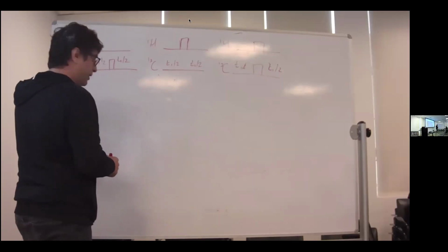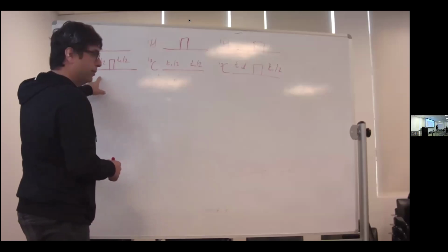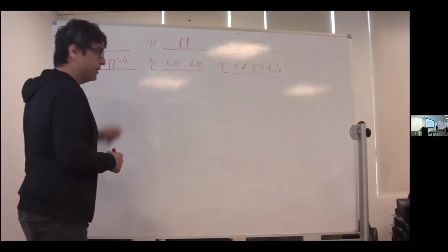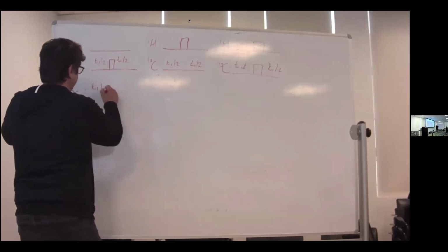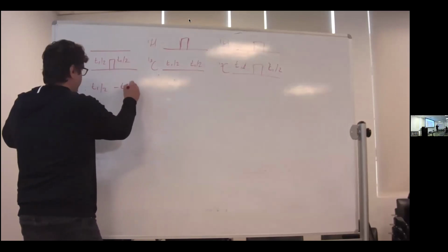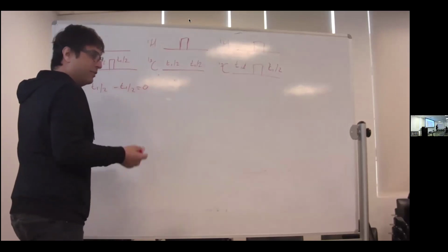So let's start with chemical shift. What happens here for carbon chemical shift evolution? How would I write that? What's the time evolution period? There's no net evolution. So what I would write is t1/2. There's a 180. So now I subtract the next period, minus t1/2. So I get 0 evolution, right? So this is a silly pulse sequence, at least from the chemical shift standpoint.